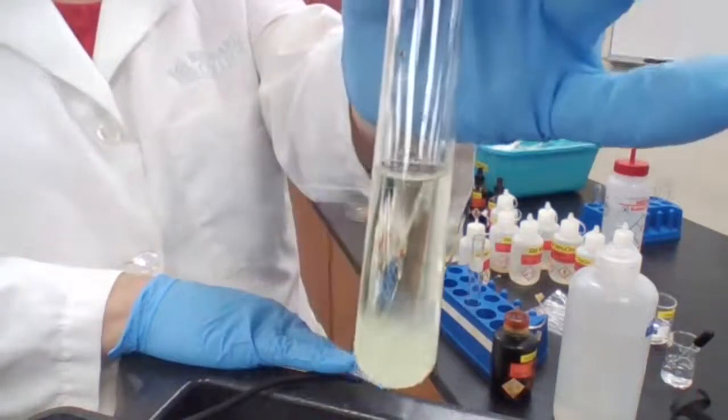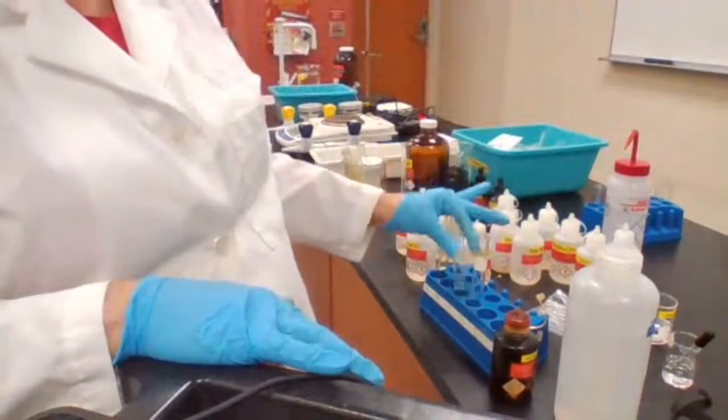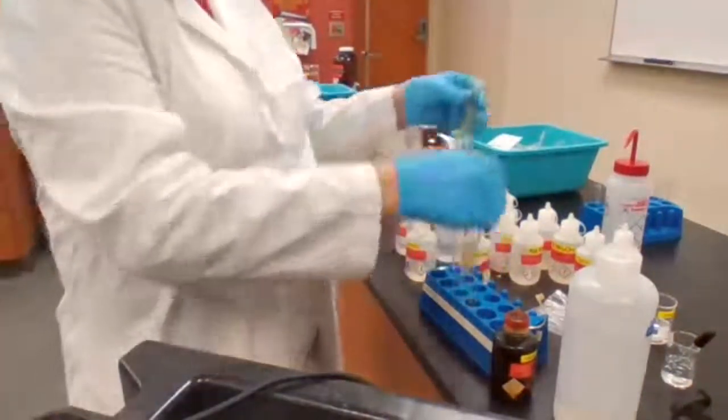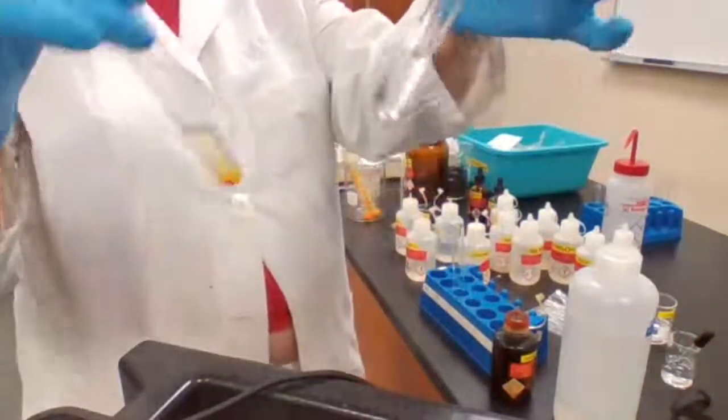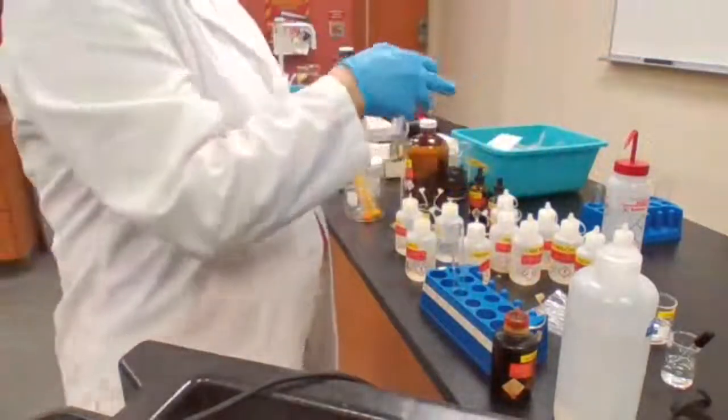Positive. C is positive, A and D are negative. A and D are negative because they didn't turn cloudy. Okay. C is positive.